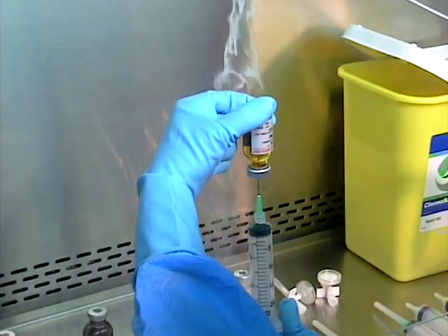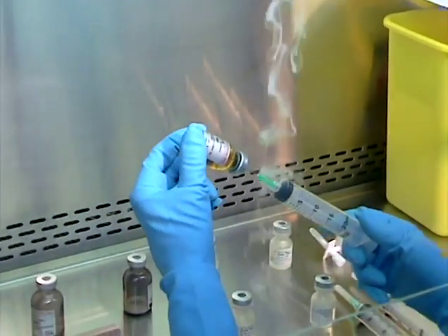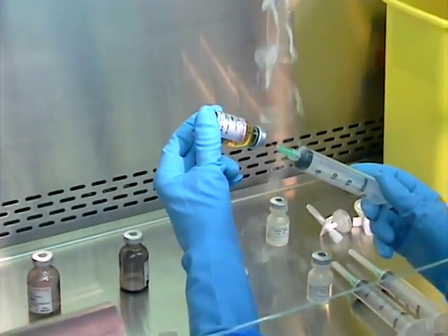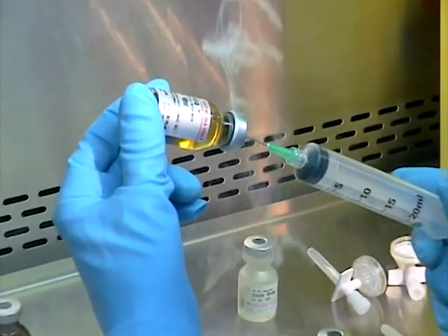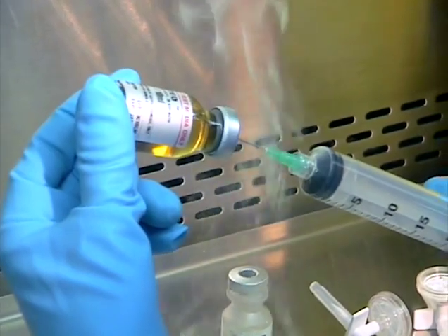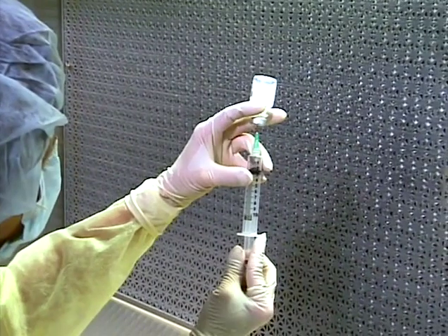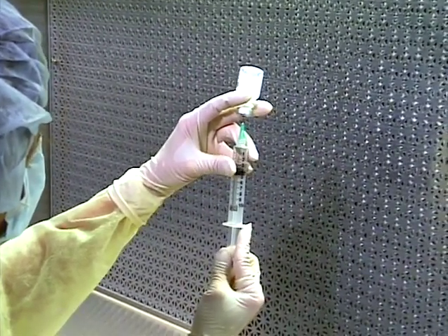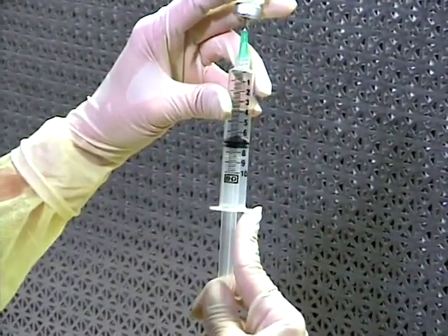Do not block the flow of first air. In a vertical flow cabinet, this is best accomplished by holding the assembly so that the vial is slightly higher than, but not directly above, the syringe. In a horizontal flow hood, the vial syringe assembly can be completely inverted and held vertically. When drawing fluid out of the vial, always pull in a slow, steady stream, which minimizes the production of bubbles.